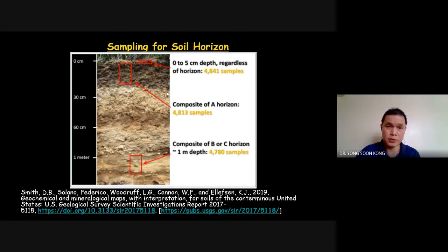And this one is like I told you just now, soil horizon. Why are they different? See, even soil also has 5 horizons. They are not the same. And if you want to take a soil sample on the surface, you also have to consider whether there are any objects that are not representing the soil. You have to remove them, like gravel. When you take your soil samples, remember you have to remove the gravel and the organic matter. Then only you sieve to 2 mm. Remember, that is one of the methods that we use to homogenize the soil.